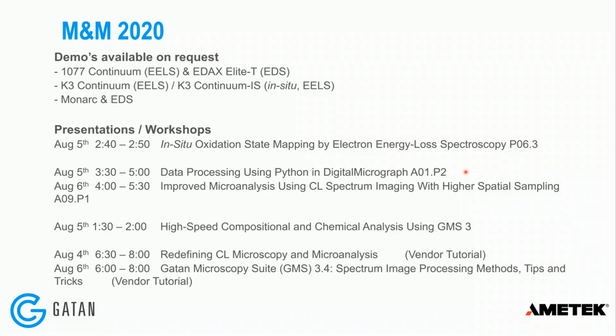But as you mentioned, if you do park the beam on it and for some reason the safeguards fail, you could damage the sensor. But the same is true for a phosphor scintillator. I've seen some pretty badly melted phosphor scintillators where someone parked a diffraction spot on the sensor. It's actually more work to change the indirect detector than the direct detector, isn't it?